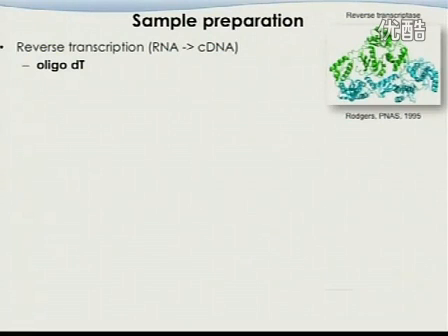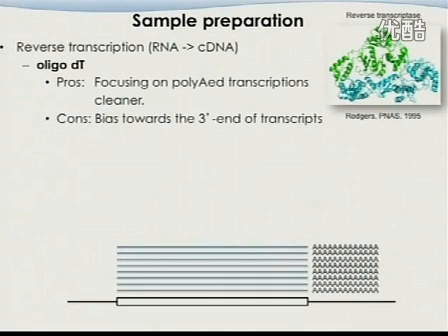So you have to do at certain stage to convert the RNA to the cDNA. And there's multiple ways to do that. The first one is to use the oligo-dT, which means that if this is the gene, there's an RNA molecule here. It's our hope that all the messenger RNAs have poly A tails there, okay? And then what we can do is when we do the reverse transcription, we use the poly T, and then the reverse transcription will happen, okay?